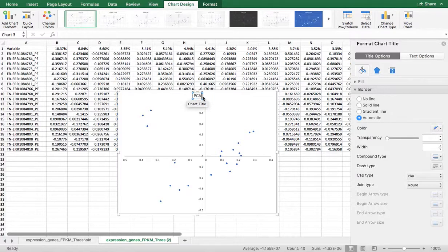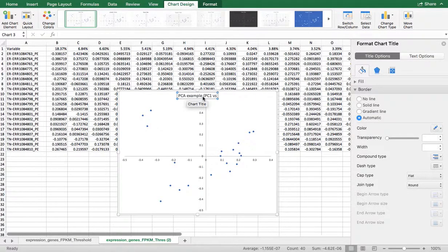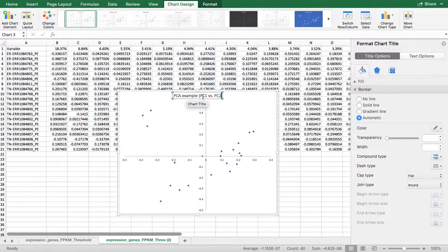So first of all, PCA example, PC1 versus PC2.